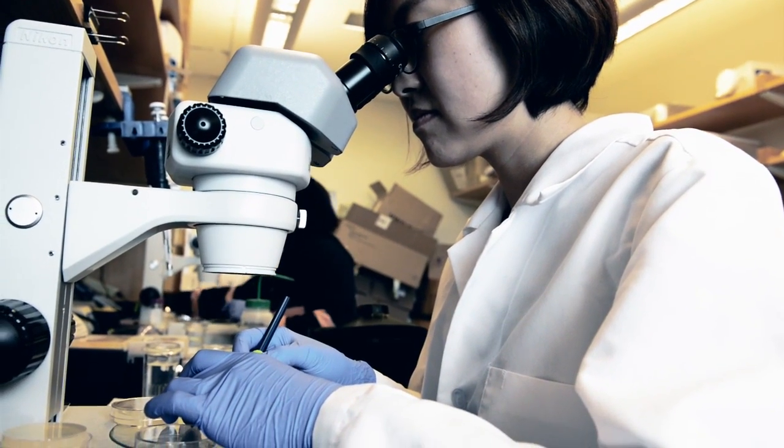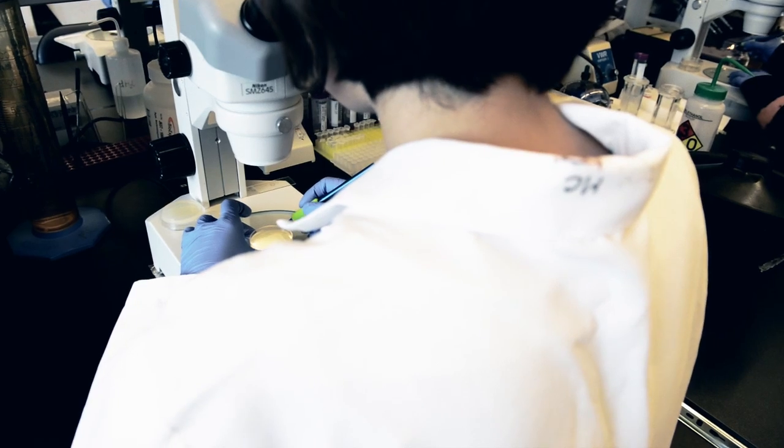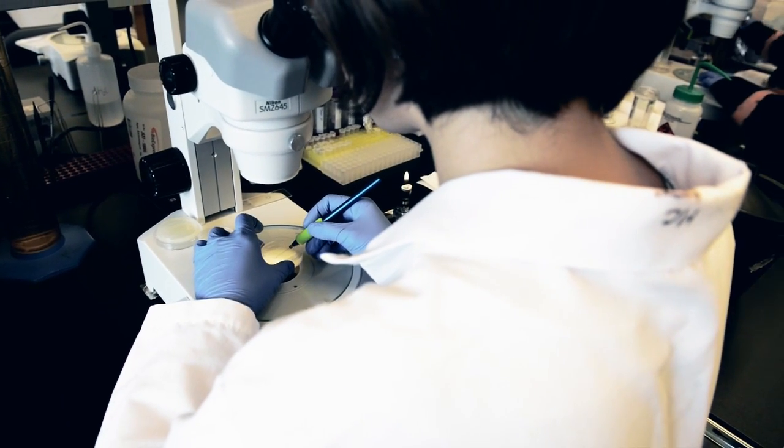The traditional way of doing lifespan experiments is that you sit down in front of a microscope and you have a population of 100 to 200 animals. Every day you go through each individual and you sort of poke it with a little rod. If it moves, it's still alive. It works great, you get the experiments done, but it doesn't really scale up that well.